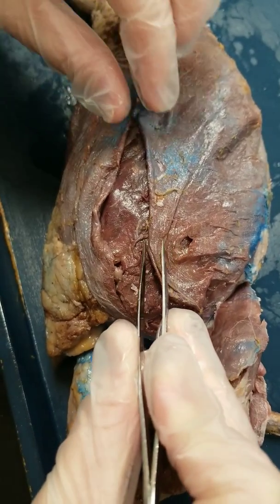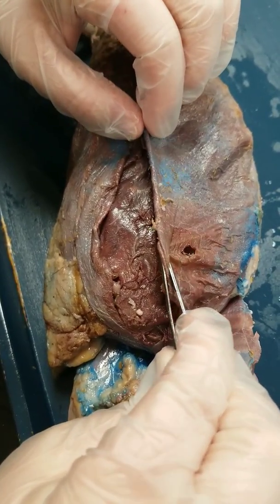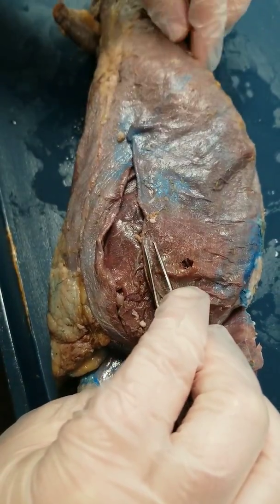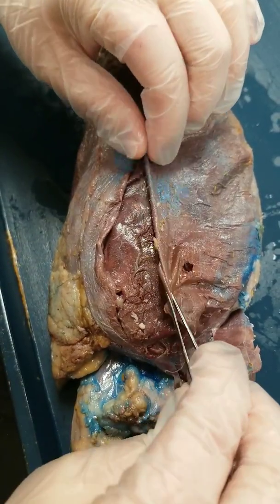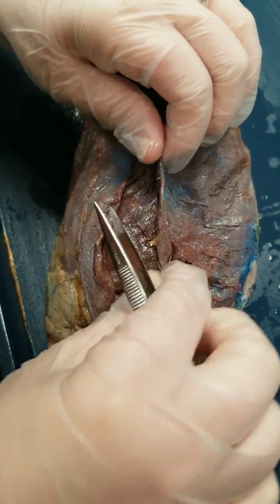We're going to start with the external abdominal oblique. This muscle is very, very thin — you can see mine already has a little hole in it. So be really, really careful when you're separating it. I usually will take my forceps and go underneath the edge of it.